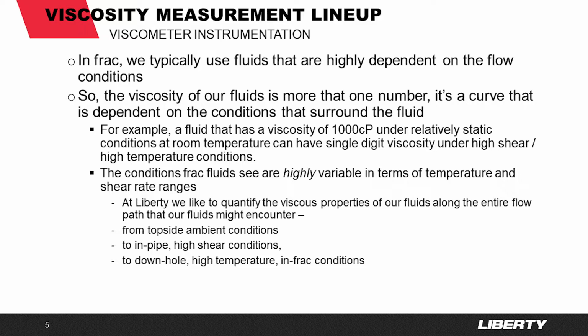The conditions frac fluids see are highly variable in terms of temperature and shear rate ranges. At Liberty, we like to quantify the viscous properties of our fluids along the entire flow path that our fluids might encounter, from topside ambient conditions to in-pipe high shear conditions to downhole high temperature in-frac conditions.